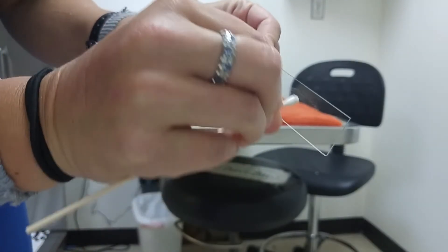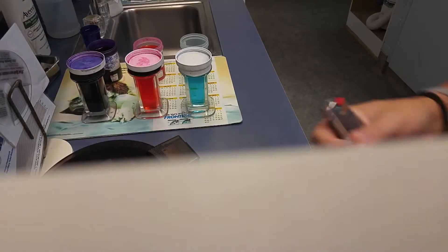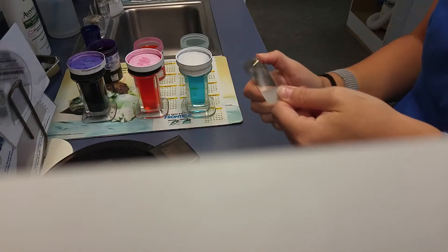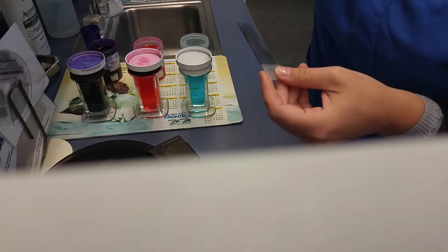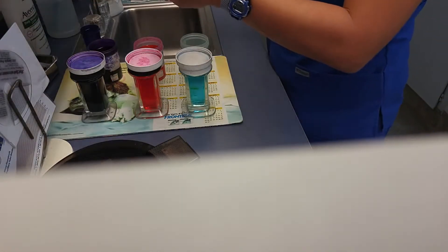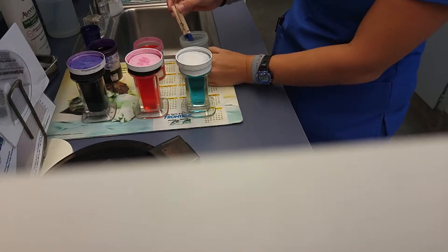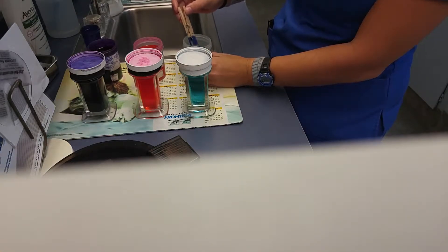I'm going to go ahead and take it and we're going to just roll it onto the slide, then we're going to take it and heat fix it real quick. Make sure it gets rolled on there really good. I'm going to heat fix it with the lighter, just a few quick passes. Rather than heat, we're going to take a chem wipe and just wipe off the blackened portion on the bottom.